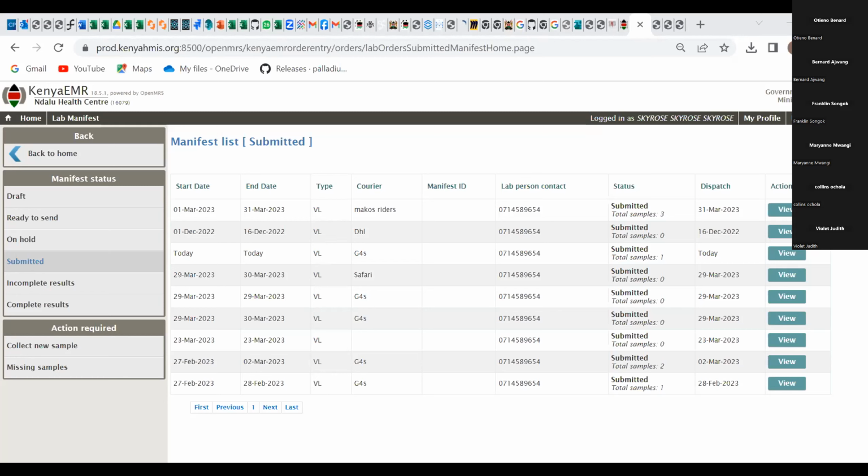However, as I usher in Otieno to respond, or Mary Ann, whoever would be taking up that, let me mention that we kindly remember we also have a help desk, a toll-free number. Whenever you have any issues, always utilize those channels of communication, so that we are able to respond to you as soon as we can. Otieno, do you want to take the error message one, or you've responded to that?